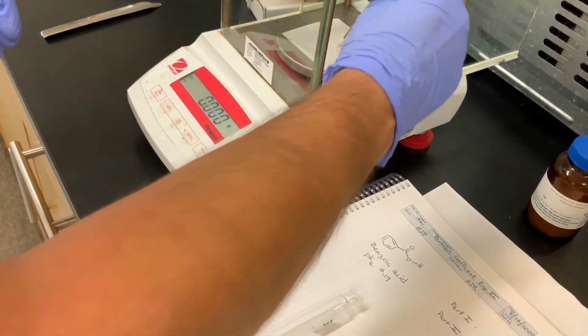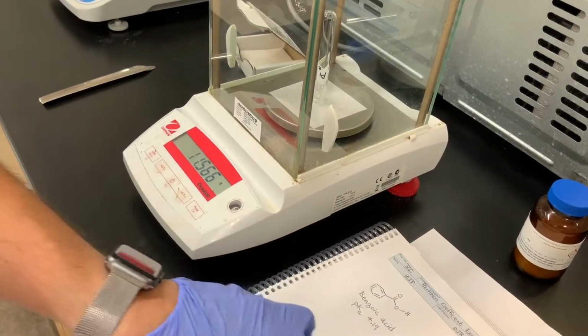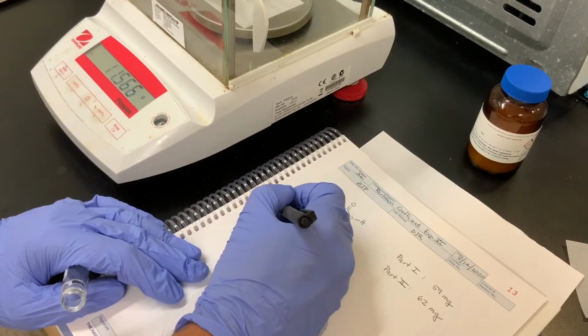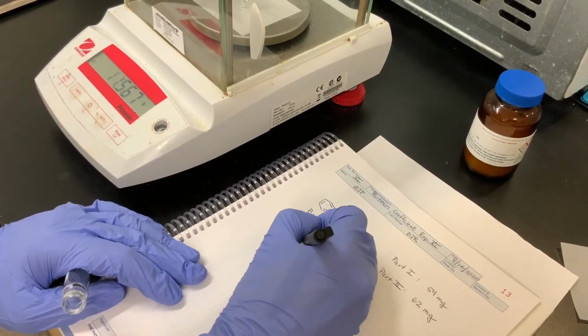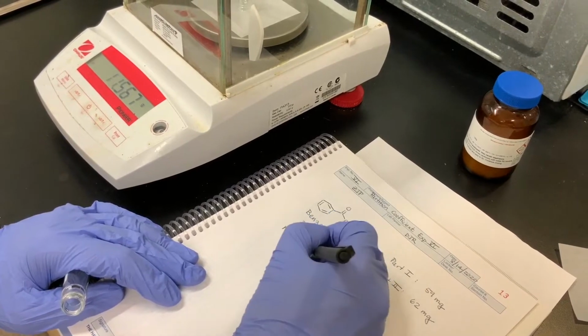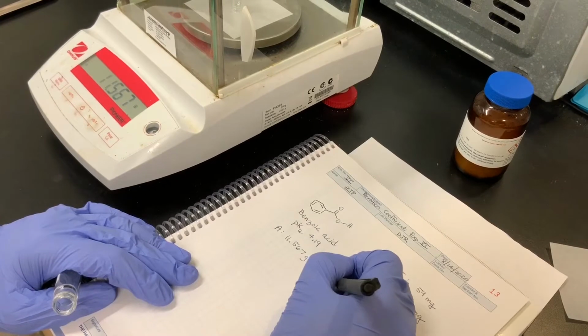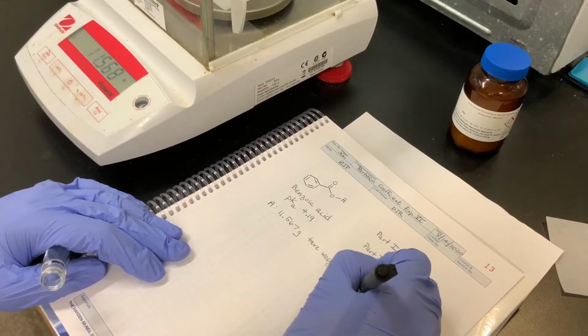I tared it, and so for tube A, it is 11.567 grams. This is the tare weight of part A culture tube.